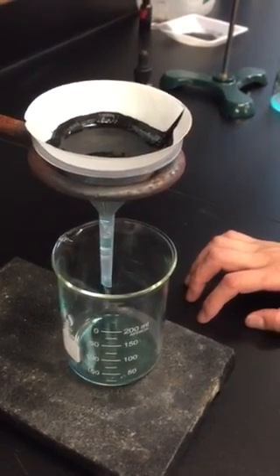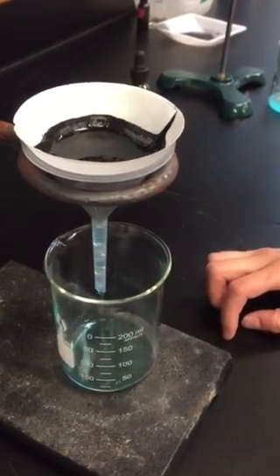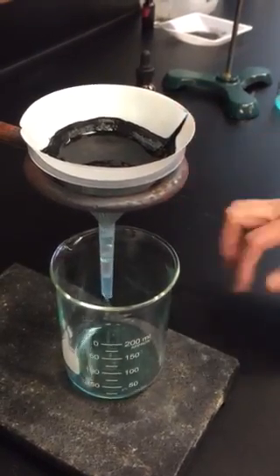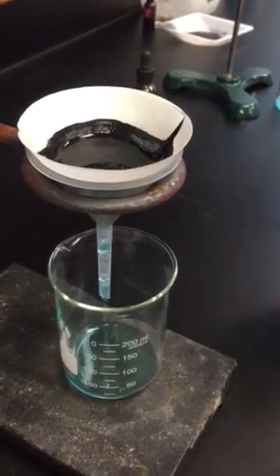You can see the dripping has slowed down a little bit because there's not much fluid in the funnel. As the pressure goes down, the filtration rate is going to go down as well.